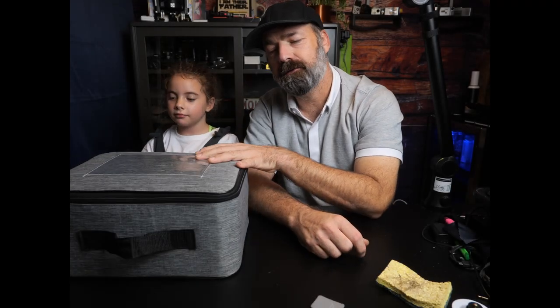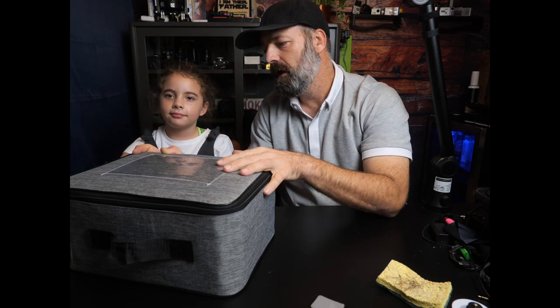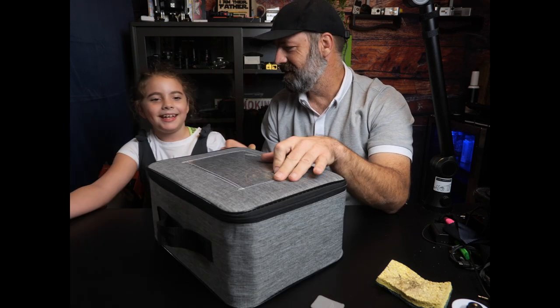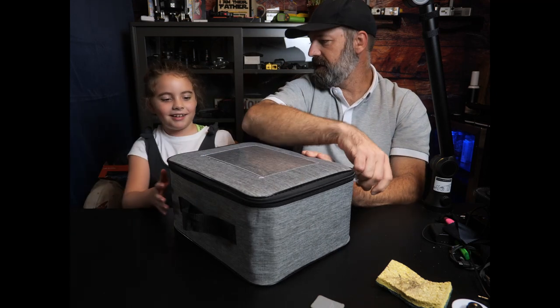Today Lizzie Jo and I are going to be opening up a microscope. We were sent this to review, unbox, and check out for you, so we're going to do it. Are you ready? Yes. All right, let's see what we're going to get. Have you seen it yet? No.